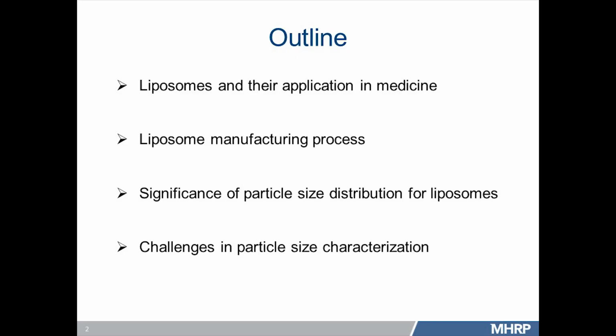They could be monodispersed or polydispersed. By polydispersed, what I mean is the heterogeneity in the particle size distribution, and by monodispersed, I mean that they are quite sharply distributed in their range of size.